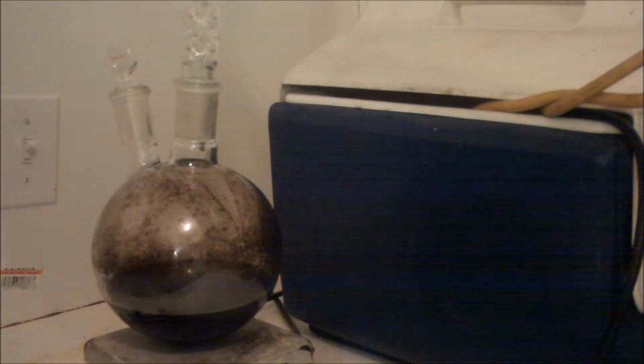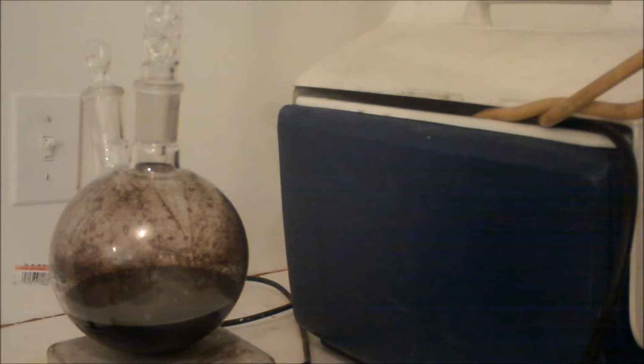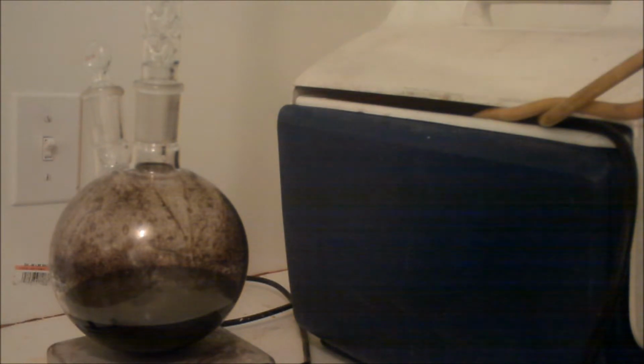I have to move the camera over a little bit, guys. A little bit slower. Okay, so we have sulfuric acid now dripping into the solution while it's stirring at the same time. I don't see any gas being present. My flask is unfortunately quite dirty. So I'll get back to you guys once I start seeing a gas form.